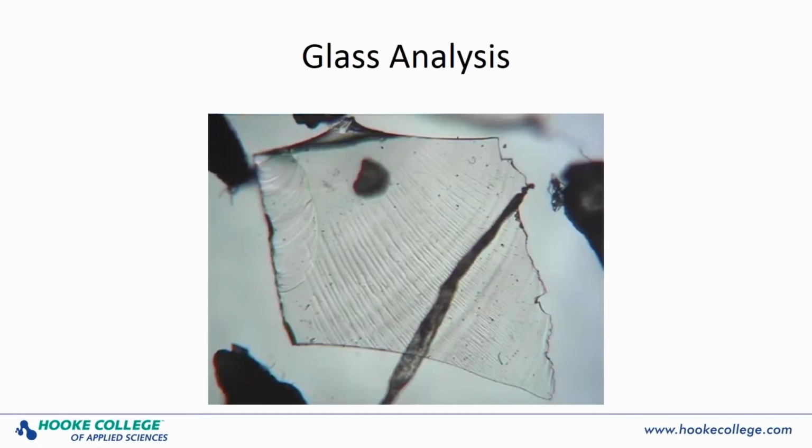Glass particles. Glass is actually an extremely viscous liquid that can be thought of as an amorphous solid. It has no inherent or internal crystallinity and thus exhibits only one refractive index. The index can vary depending on the chemical composition of the glass.